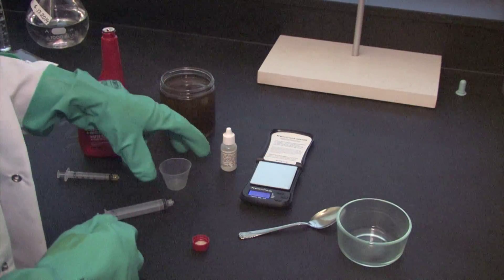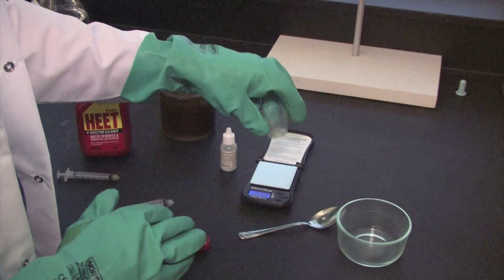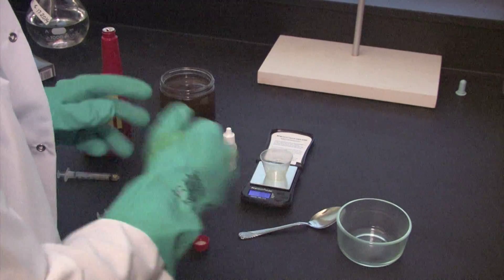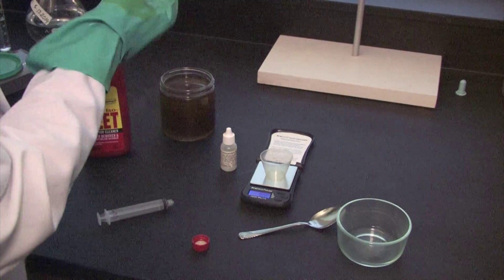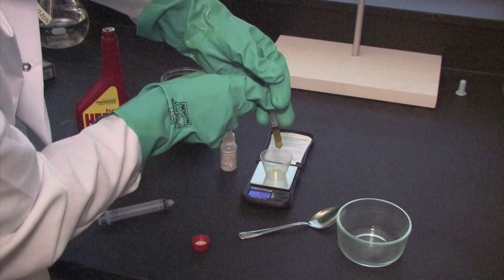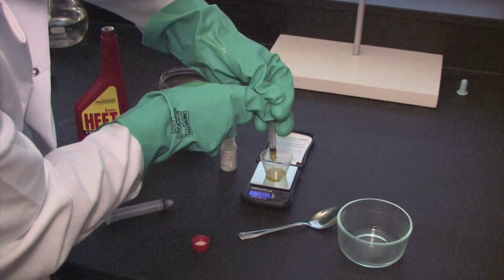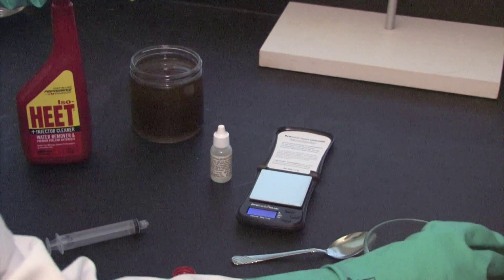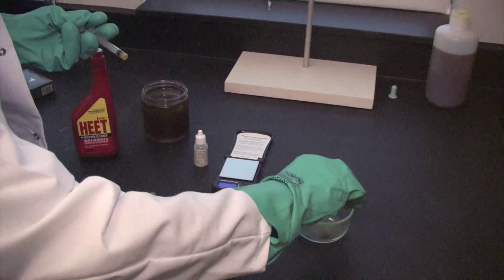Next we're going to measure out our oil feedstock. We'll take the scale, put the medicine cup on there, get it tared properly, and then take the smaller syringe to measure out about a milliliter of oil — that should end up being about 0.8 grams altogether. We've got our 0.8 grams and we're going to pour that into our glass dish along with the isopropanol and the phenolphthalein indicator.